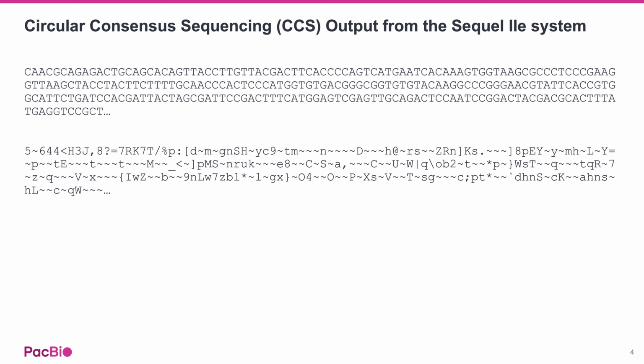This overall read quality score depends mostly on the abundance and quality of the lowest confidence bases present, and 1 minus the score should agree well with the average per base error rate of reads with that score.